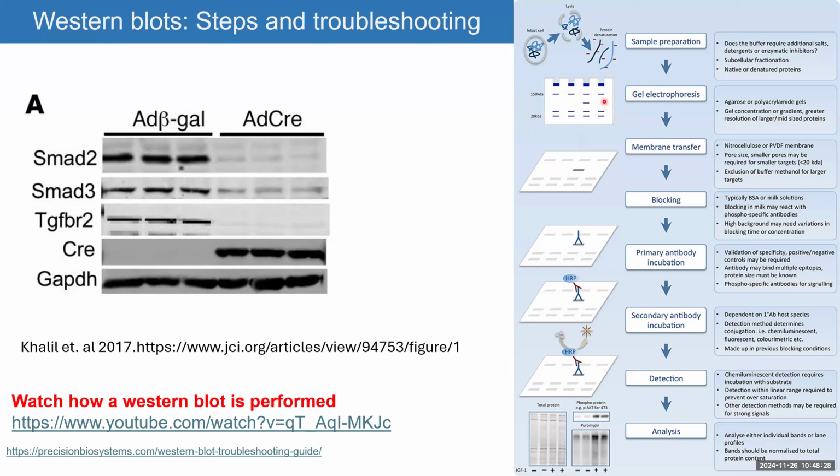So these are questions you should ask yourself before doing the experiment. I'm just thinking out loud with you. One day you need to come back to do this experiment. Then you transfer your gel into the membrane, so you have the blot. You can see that each band you have here has been blotted. So you have 4 there, and all 4 are blotted here. Exact copy paste. Now, instead of the proteins being in the gel, all the proteins are on the membrane.